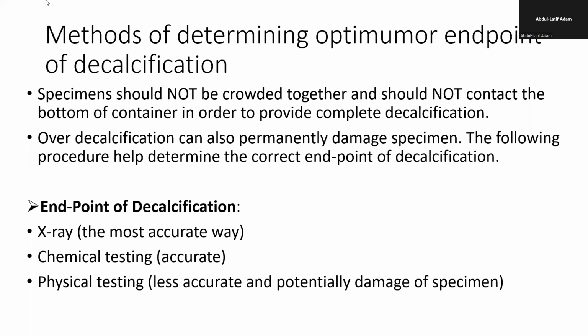Okay, and so there is the tendency that you miss some. Okay, so the physical method is the most insensitive method of all the methods. Okay, is the most insensitive method.